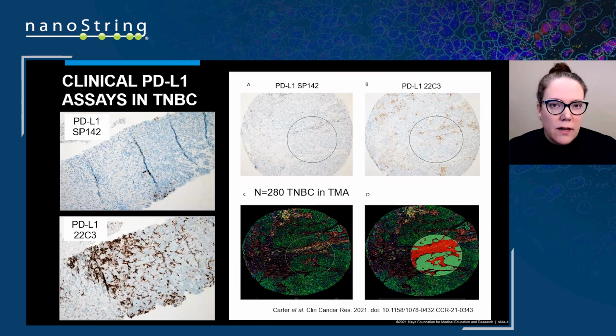These data are from a couple of years ago before we had transcriptome available. So what you can see in the lower right panel is our segmentation strategy with genomics. Very straightforward. We were targeting the intraepithelial tumor segments, the breast cancers, with their immediately adjacent stromal microenvironments.